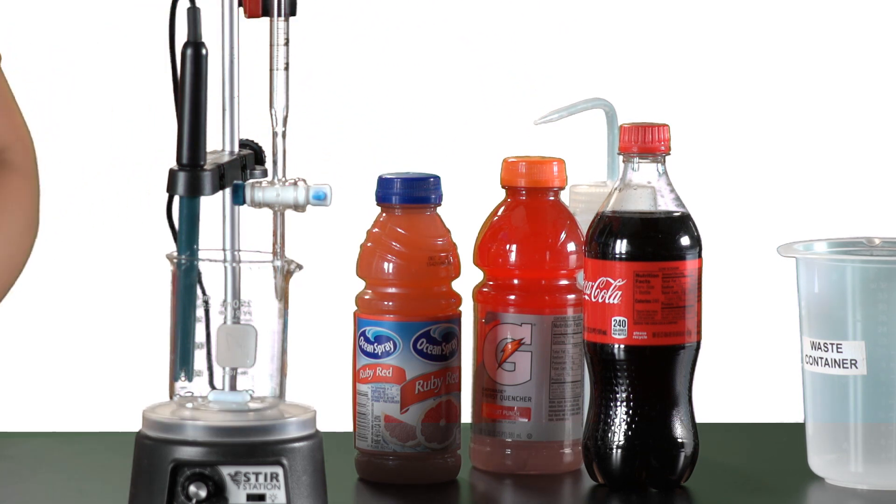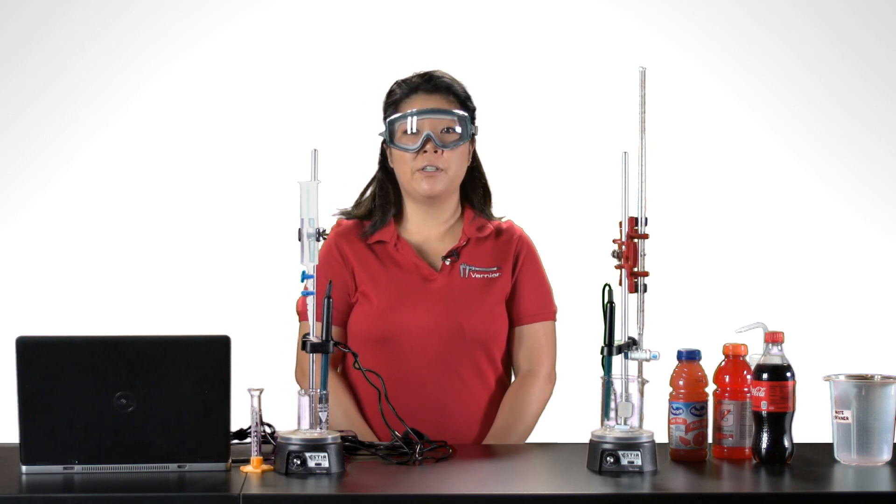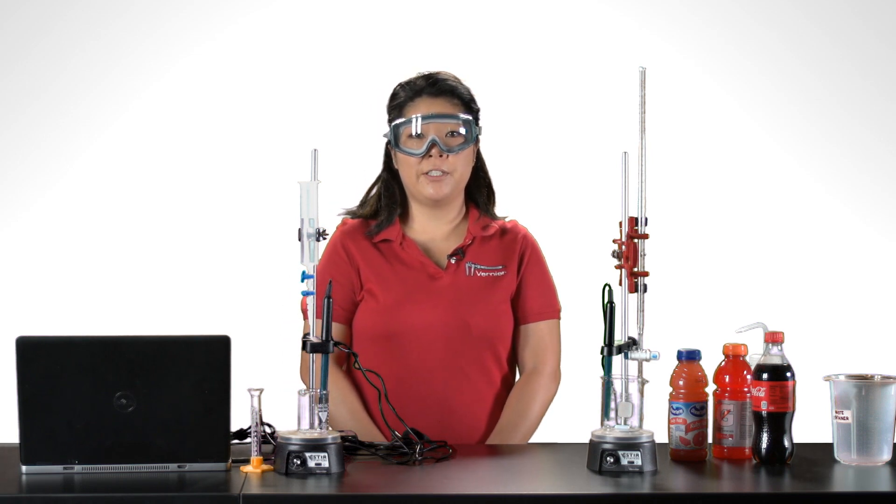You may also be able to identify the acid. There are some additional challenges that need to be considered when titrating beverages. Here are some points to consider. Soft drinks and fruit juices can contain more than one acid. Consider how this will affect the titration when determining the acid concentration.